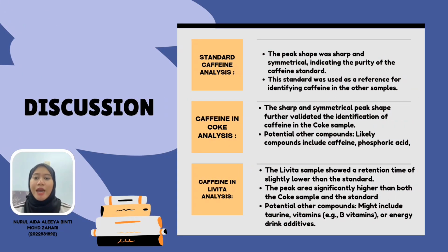For discussion, the standard caffeine solution was analyzed to serve as a reference for identifying caffeine in other samples. The peak shape was sharp and symmetrical, indicating the purity of the standard caffeine. These parameters set the benchmark for comparing the caffeine contained in other tested samples.